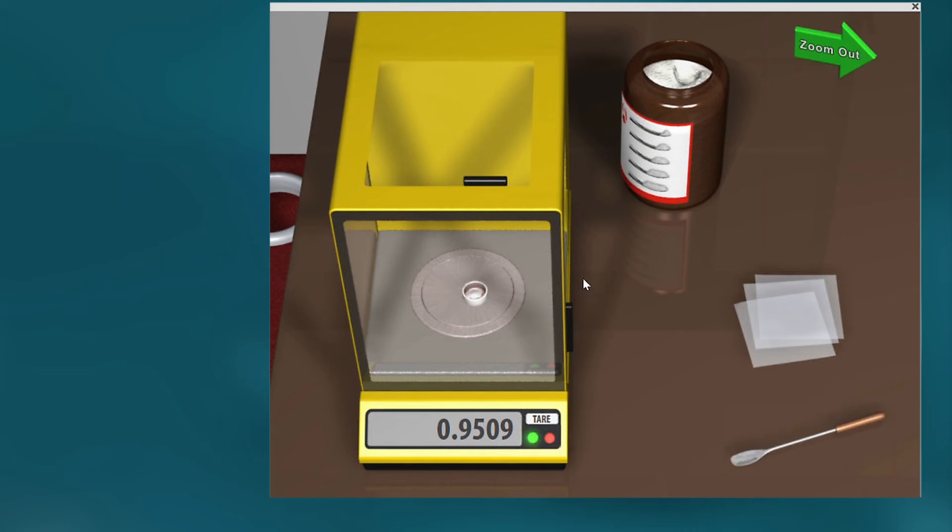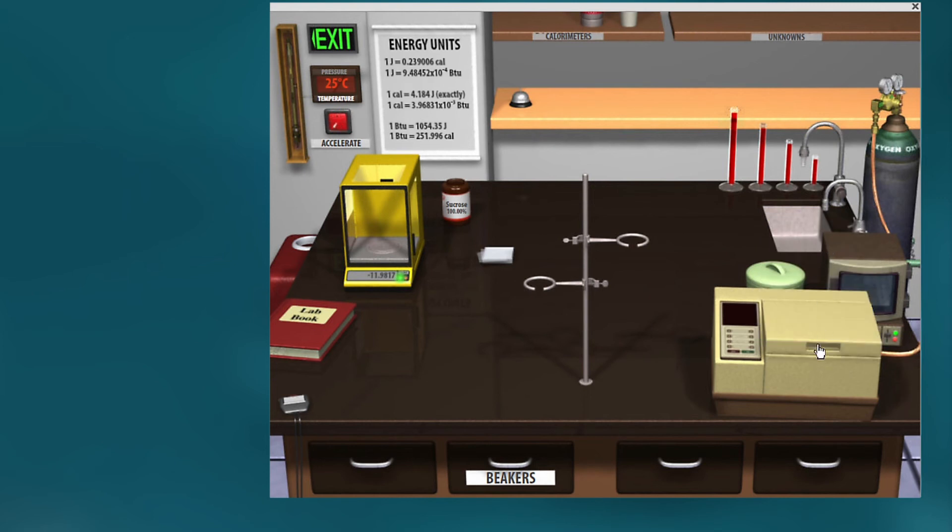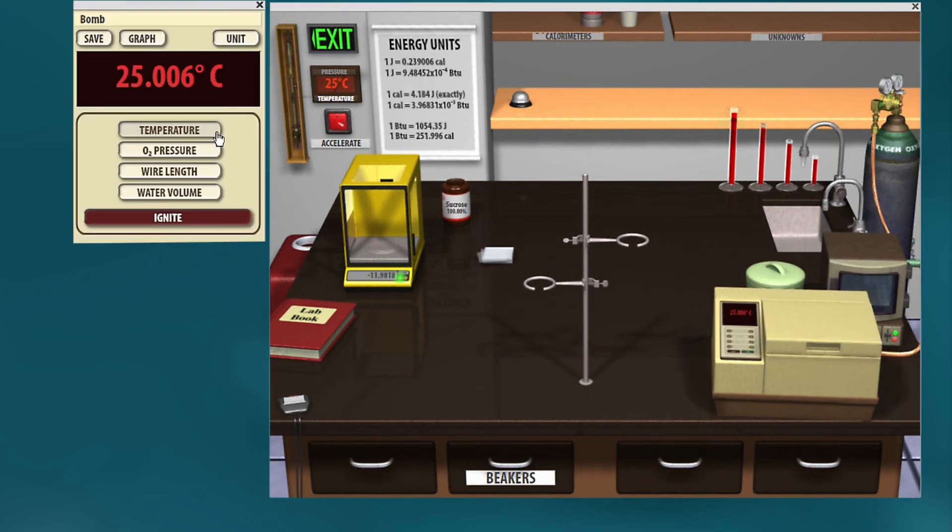Okay, so about 0.95 grams, close to the same amount, and then we'll load that up in and follow the same procedure of igniting the sucrose to see how much the temperature of the water in the calorimeter rises.